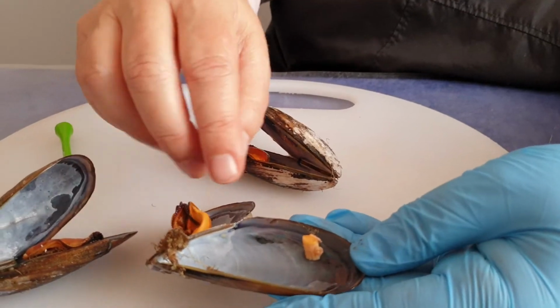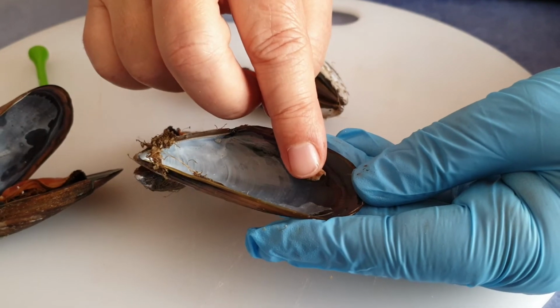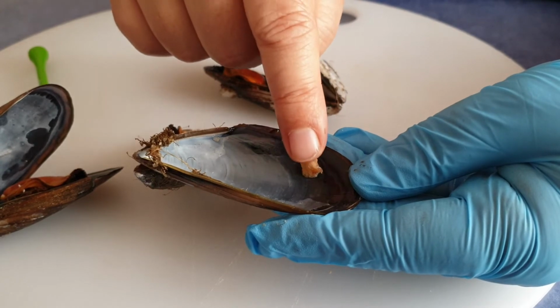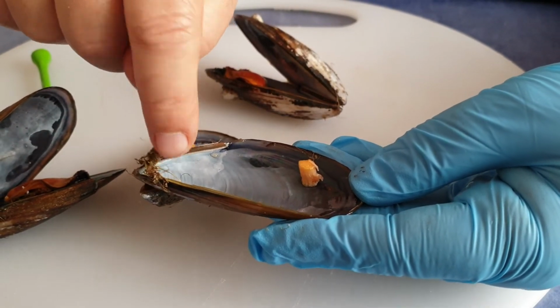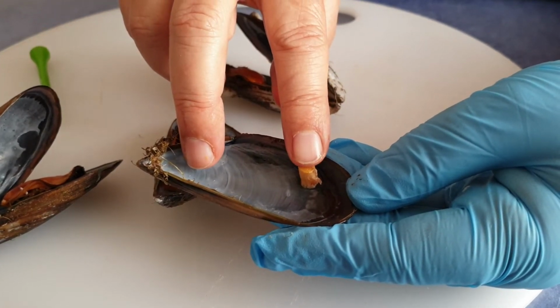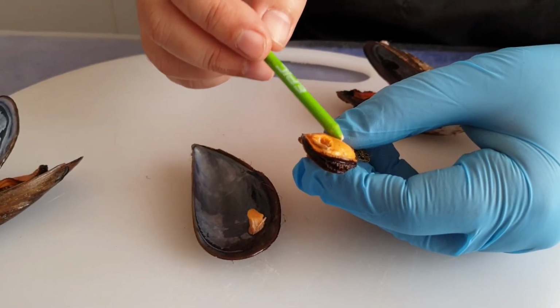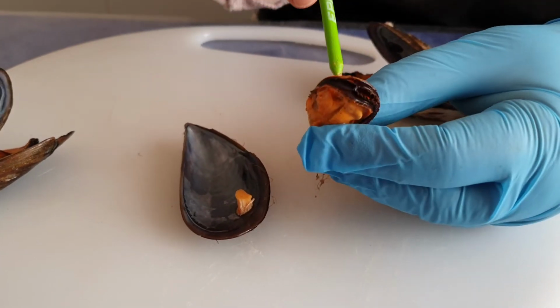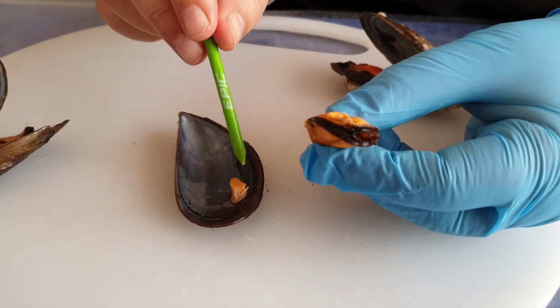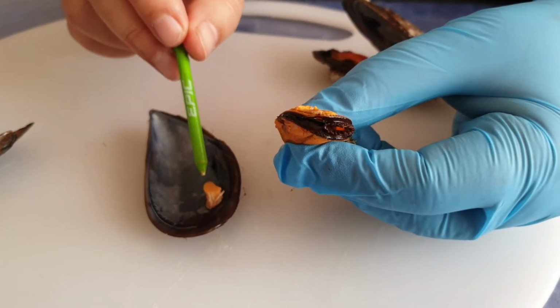Look at this. This thing corresponds to a muscle that closes the shell. The muscles that close the shell, that is one here that is very big and one here that is very small, these are adductor muscles. When we remove the mussel from the shell, this hole appears. This hole is due to that in this part was the adductor muscle.